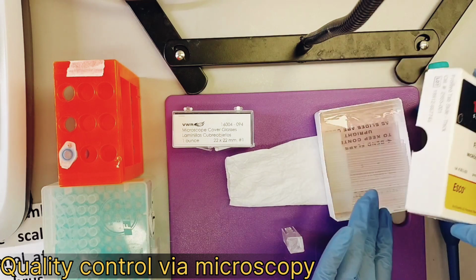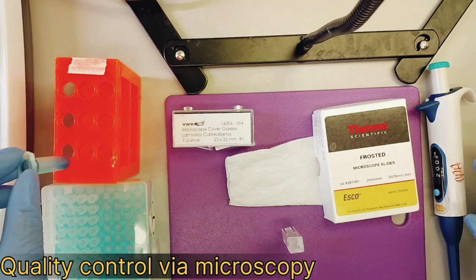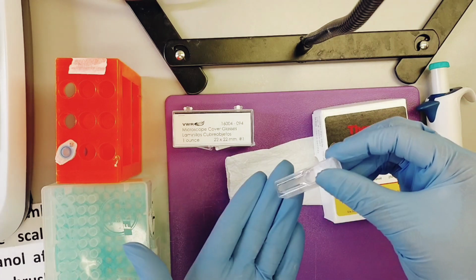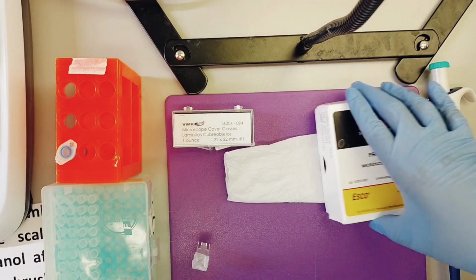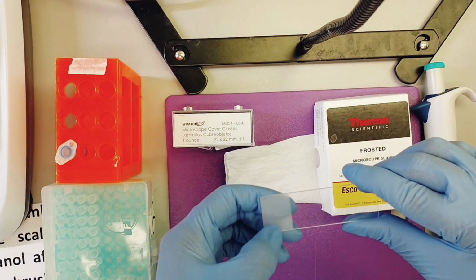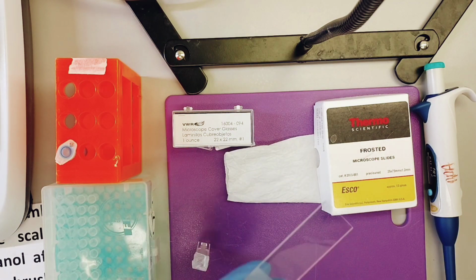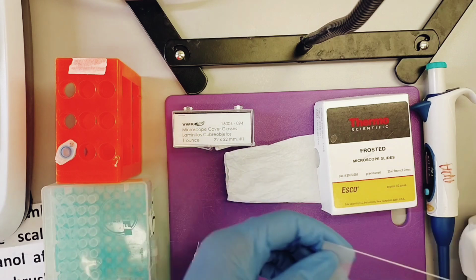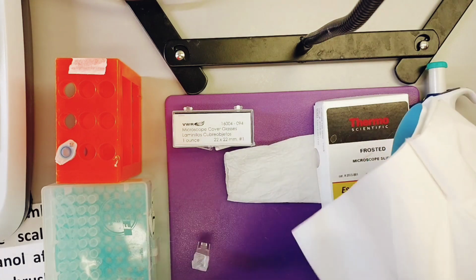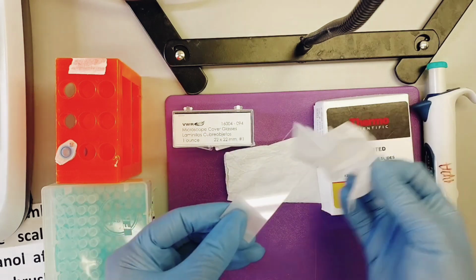I have the frosted glass slide, the cover slip, and the lactophenol blue to provide contrast. And then this is a sample from the spectrophotometer that I did a concentration of. So I'll do that. There's a frosted edge of the slide, and I'm just going to use some lens paper to clean the slide.